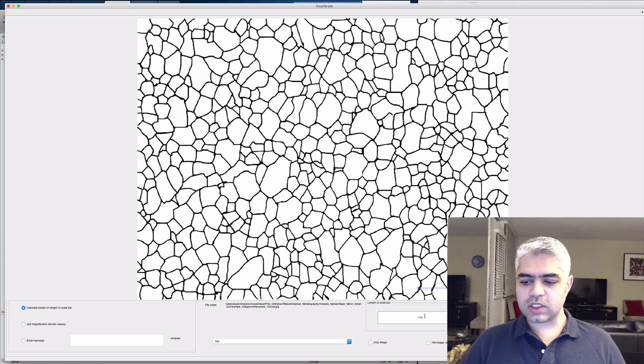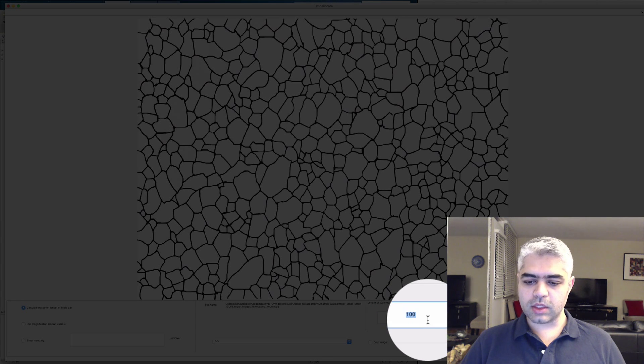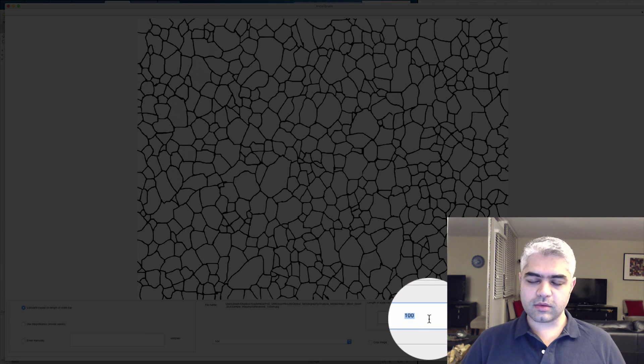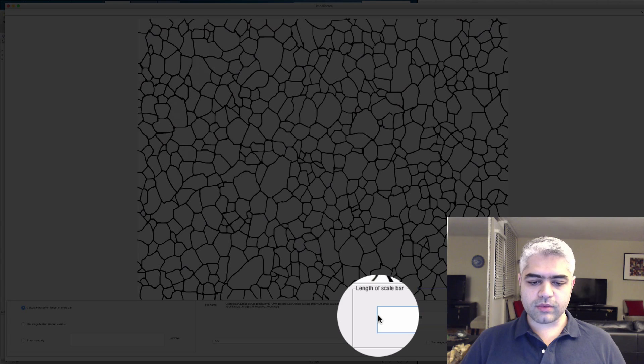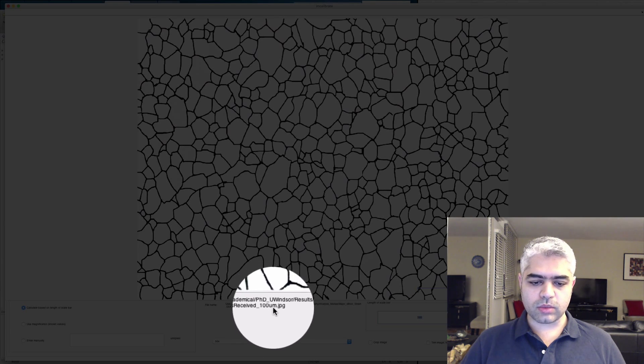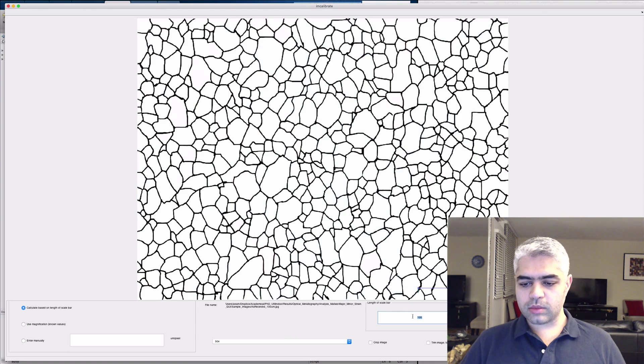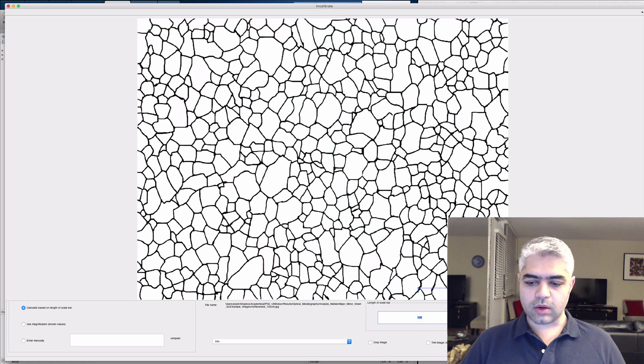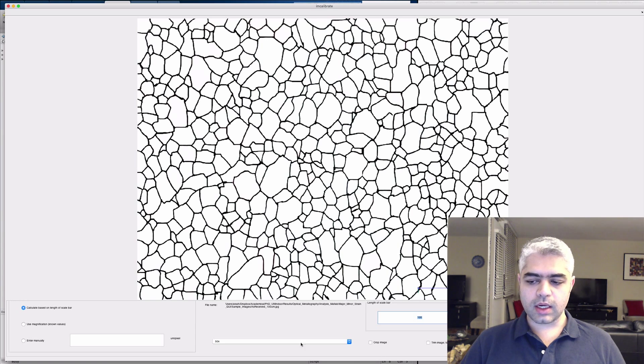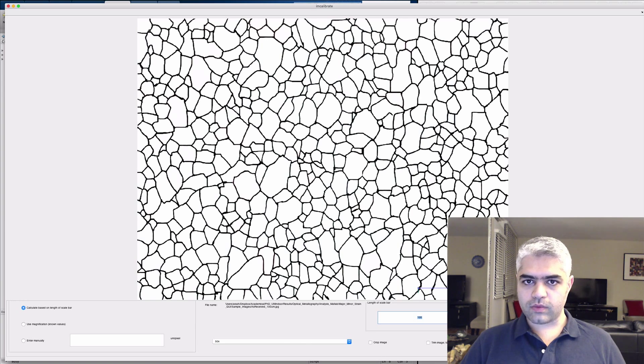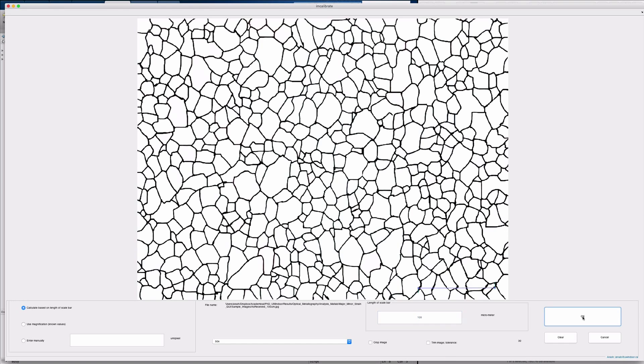Then you need to change this value—this is the micrometer length of the scale bar. Just by the name of the file, I know that the length of the scale bar is going to be 100 micrometers, so I'm going to have 100 micrometers here. Then just click OK. You don't need to change crop image or trim image—they're not going to work for this code.